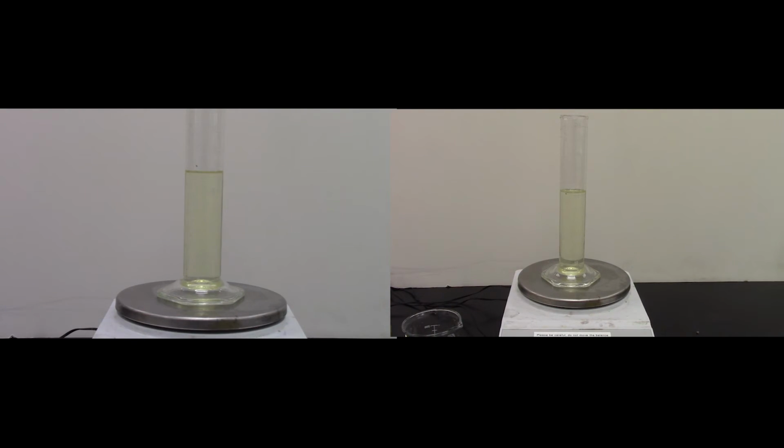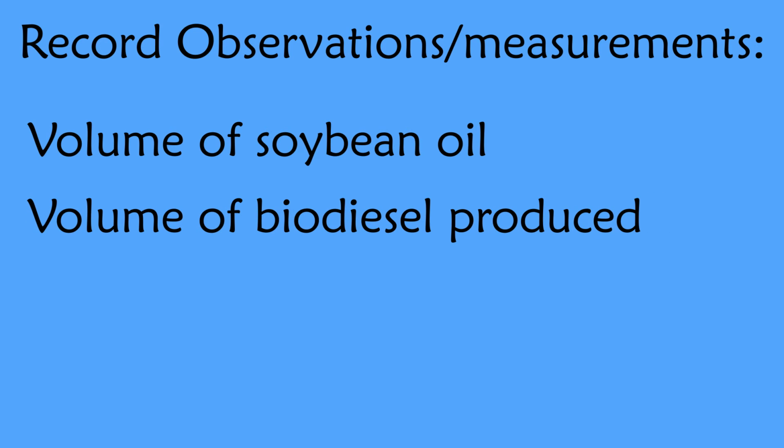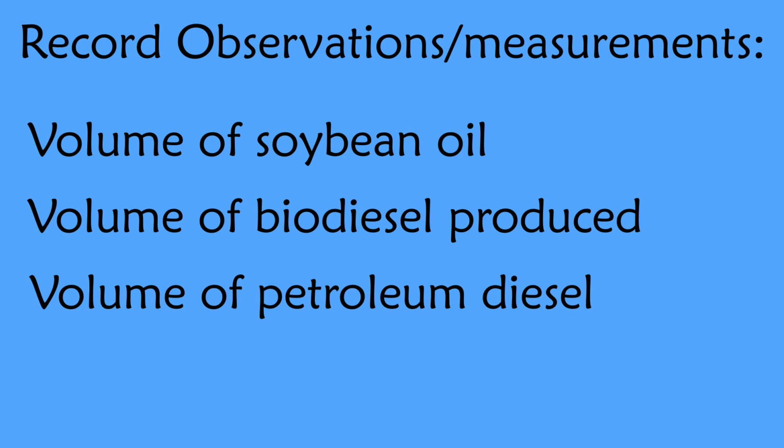Observe the volume of biodiesel fuel produced compared to the volume of the soybean oil used to make the fuel. Record your observations along with the following measurements: volume of soybean oil used to make biodiesel, volume of biodiesel produced, and volume of petroleum diesel.